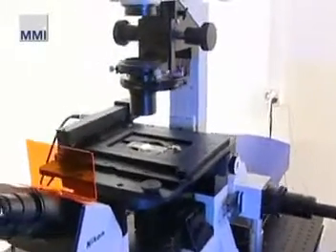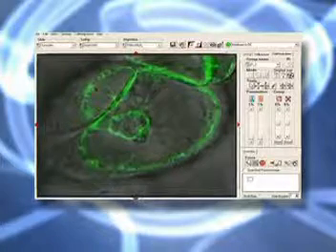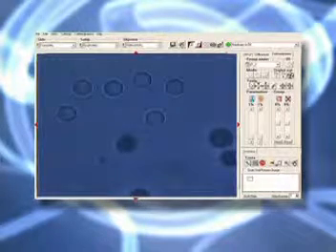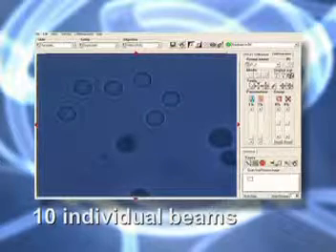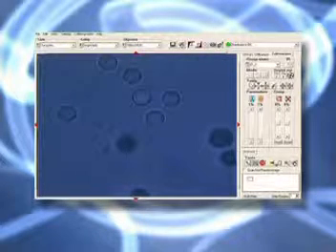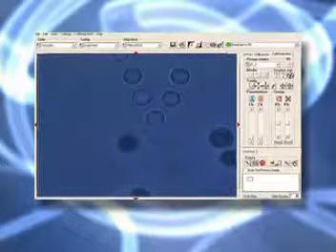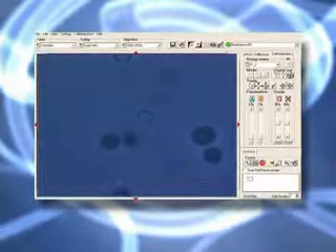The MMI Cell Manipulator is a new generation in professional multi-beam tweezers. The MMI Cell Manipulator optical tweezers feature an intensely focused laser beam to hold, move, rotate, join, separate, stretch, or otherwise manipulate in liquids up to 10 microscopic objects simultaneously. Advanced software enables contact-free, high-precision manipulation of selected particles within the entire field of view.